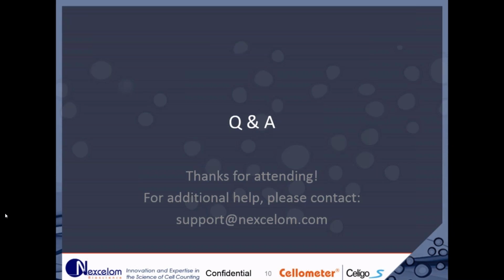For one channel, it can range between 5 and 10 minutes depending on your exposure time. So for instance, in the example today, we did 3 channels, but you'll note that for the antibody I had to turn up the exposure to what I consider really high. Something that's above 100,000 microseconds is not my favorite. I would prefer to stay below 100,000. So that just adds more time because it's every picture that you take, and for a 96 well, that's 16 per channel times 100,000 microseconds per image. So more exposure, more time.